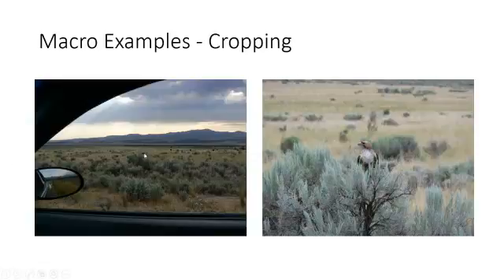If you look over here, there he is, really little. Now, he was not that little to my eyeballs. Otherwise, I wouldn't have stopped. But this is what my camera saw. This is what my eyes saw. So the point of cropping photos that you take in lab is to get the picture to look like what you saw under the microscope.